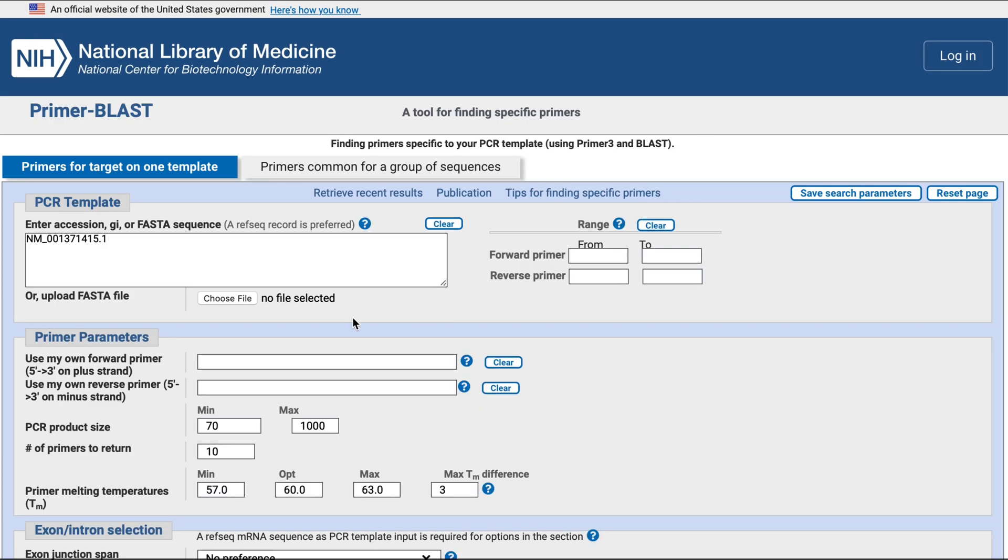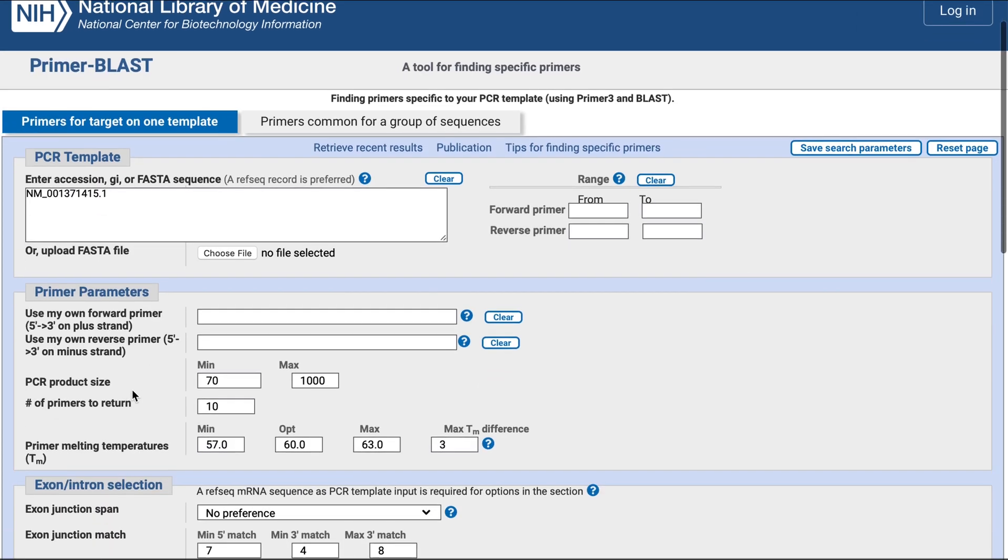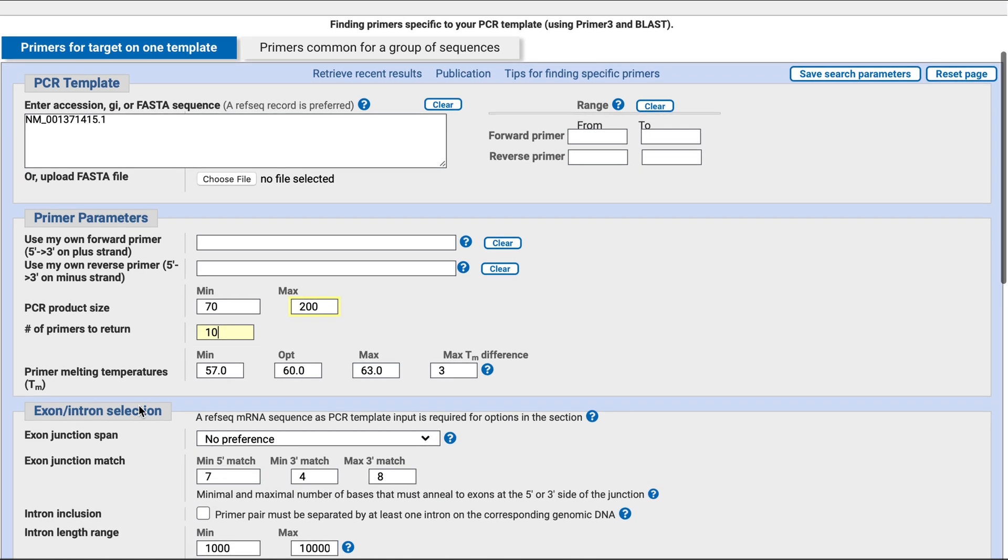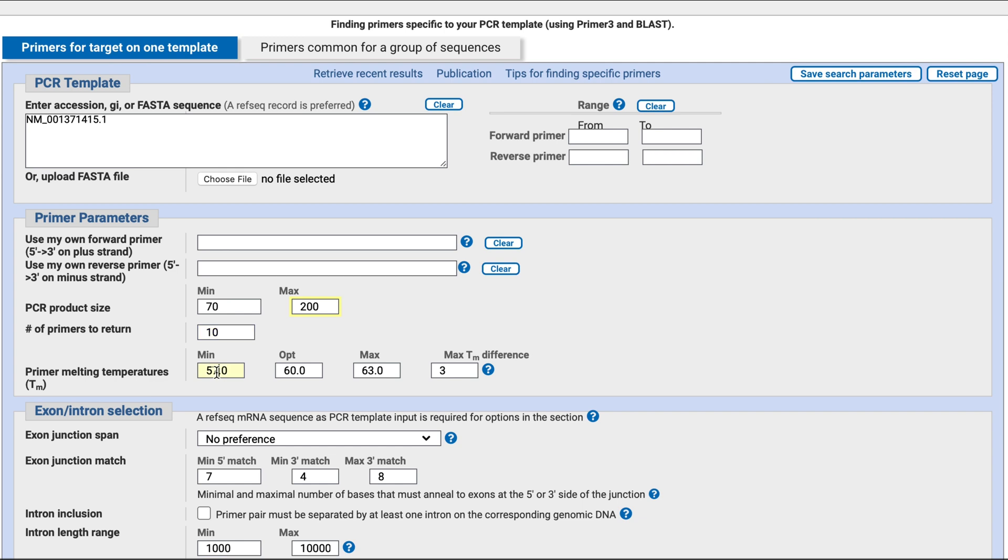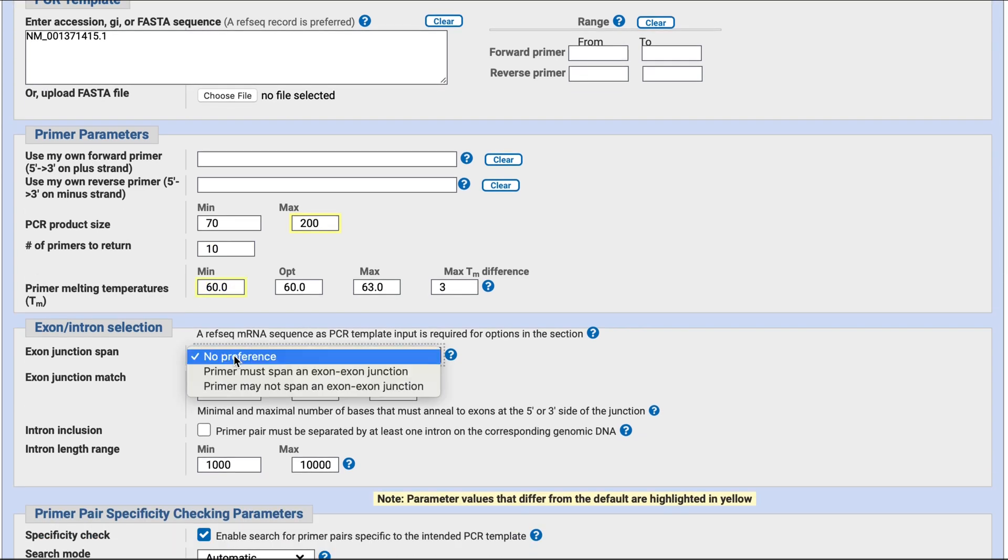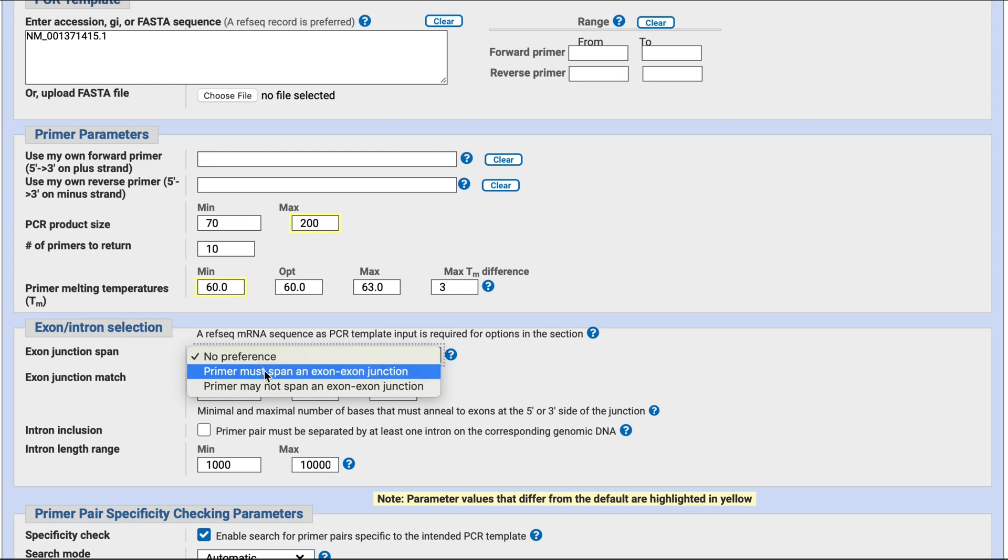Now you can set your parameters. Here, change 1000 to 200. The program will return a number of primers - you can leave it at 10. Change 57 to 60. For exon junction span, pick 'primers must span exon-exon junction.'